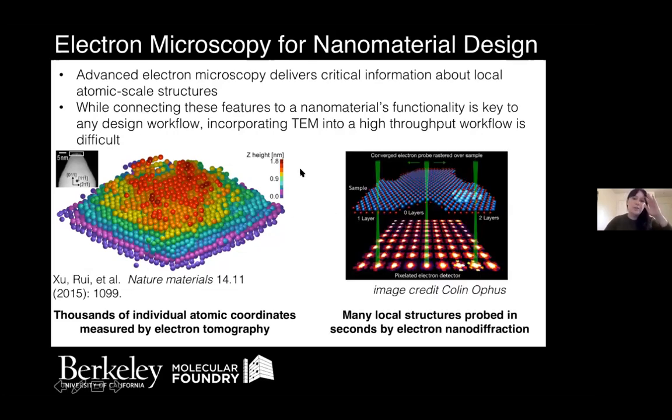And similarly, a really popular newer analysis method, or I should say imaging modality in the electron microscope is scanning nanodiffraction.